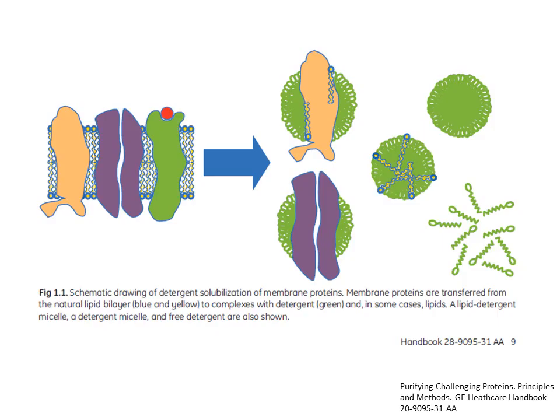What should start to be apparent is that these additives are acting like intermediaries between the proteins and the liquids that surround them and they float in, preventing the protein molecules or complexes from associating together and aggregating into large masses that can fall out of solution, such as this example where the surfactant's hydrophobic tail is interacting with the proteins and its polar head group is interacting with the surrounding liquid.